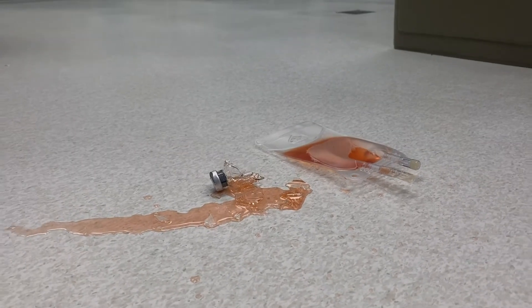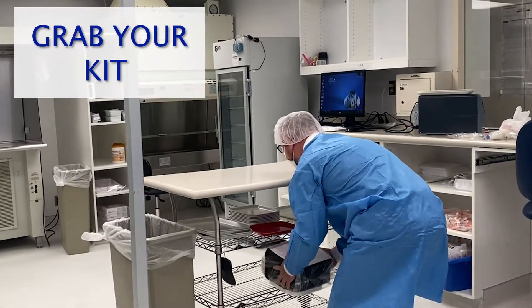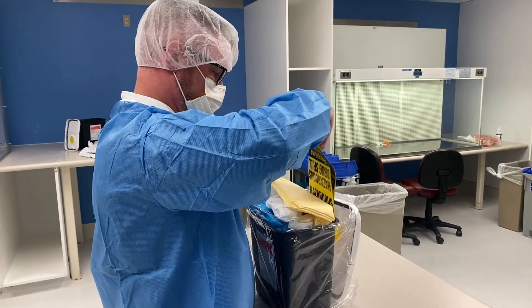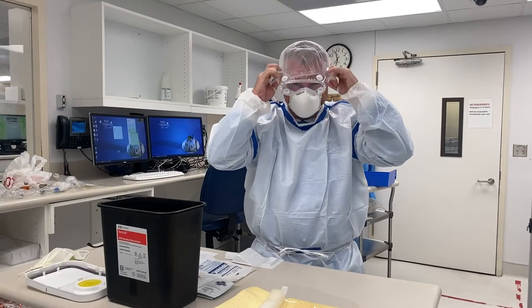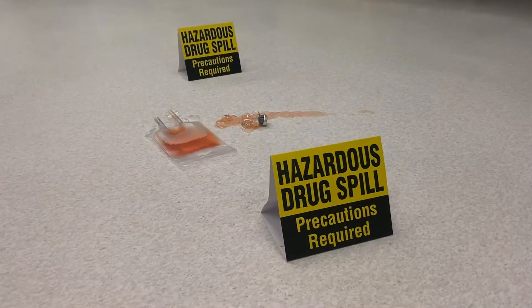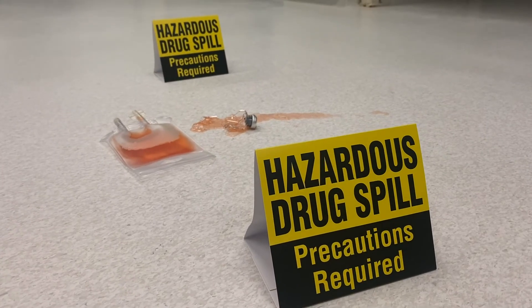If personal contamination has occurred, follow personal contamination procedures per facility's P&Ps. Open up the HD spill kit and place contents of the kit on a clean surface. Put on your N95 mask or face shield, then proceed to put on other personal protective equipment or PPE. Use the two yellow hazard drug caution signs to mark the HD spill area.